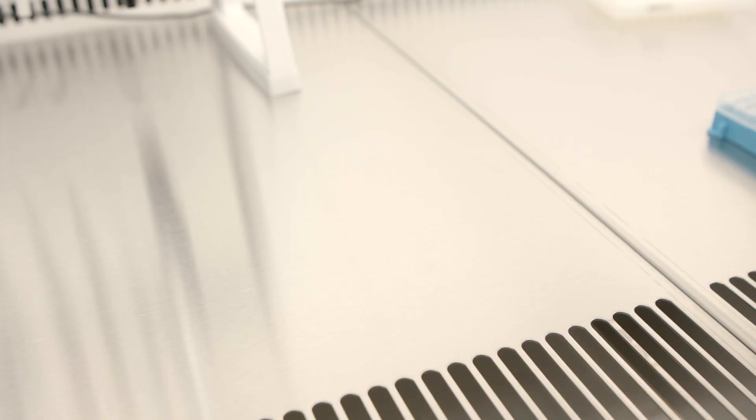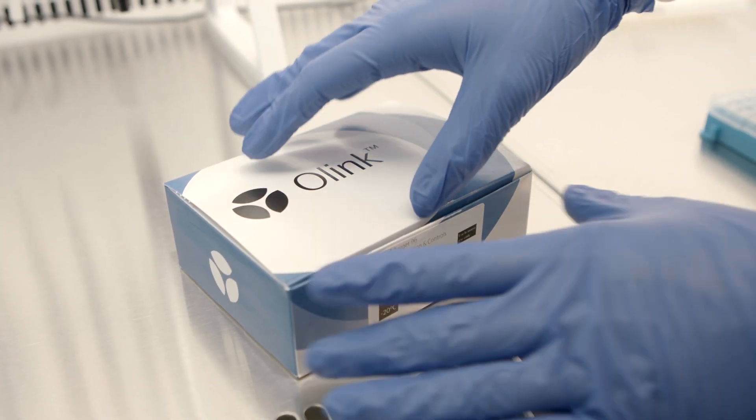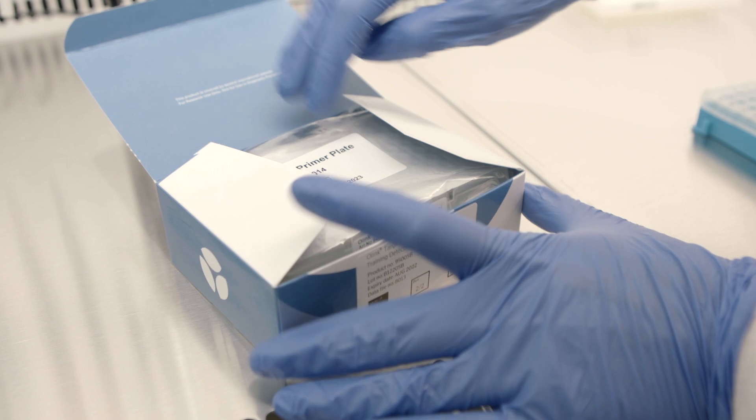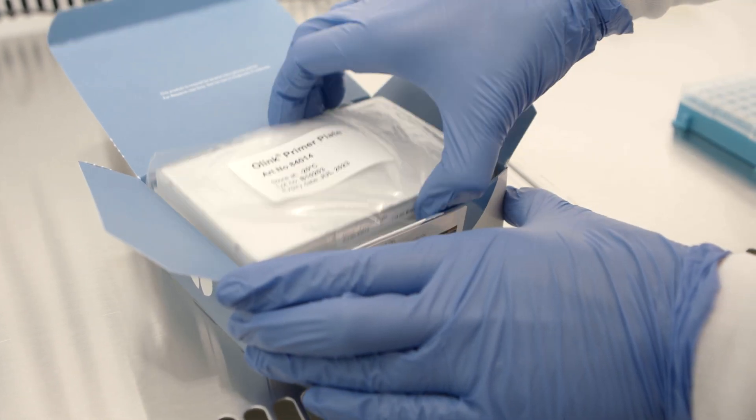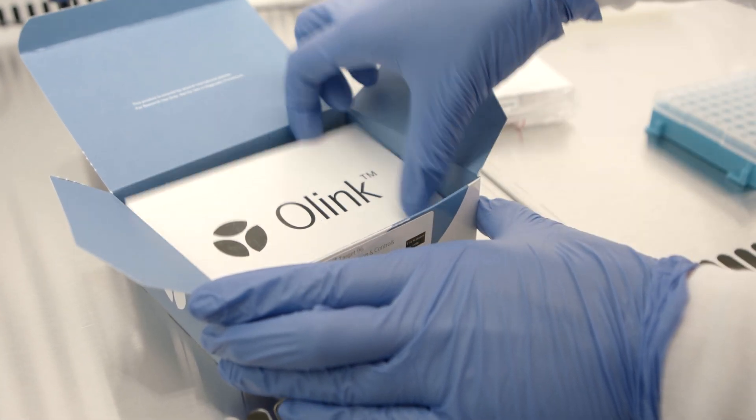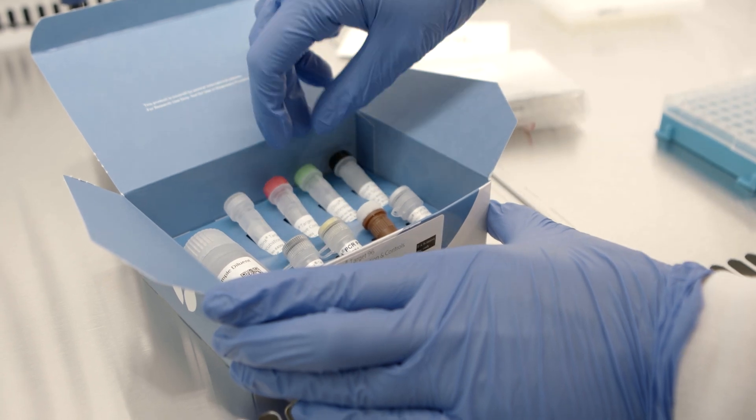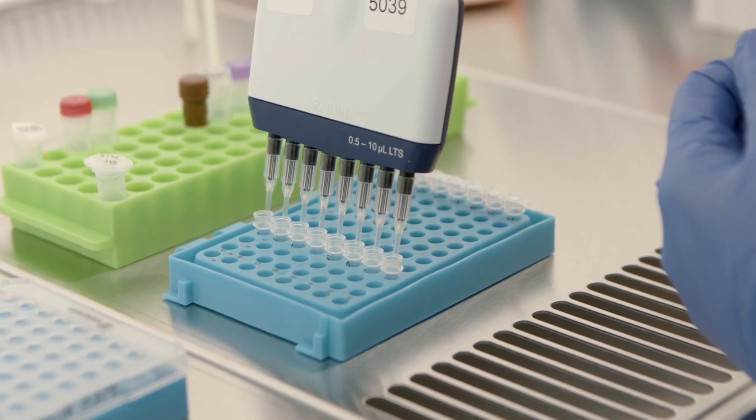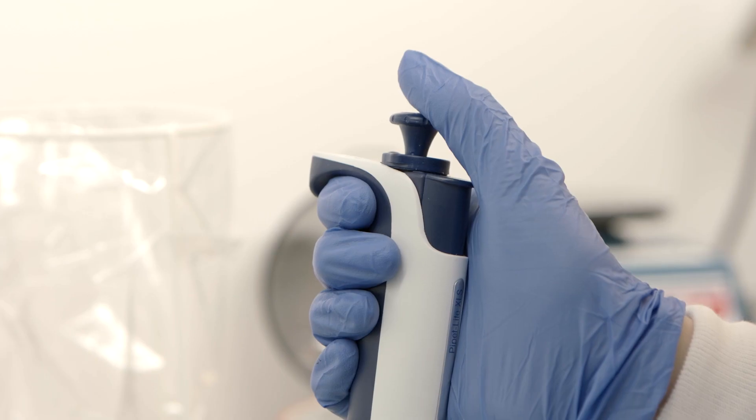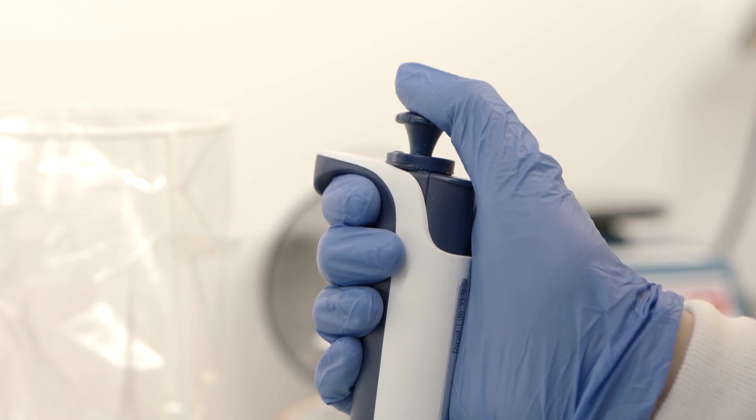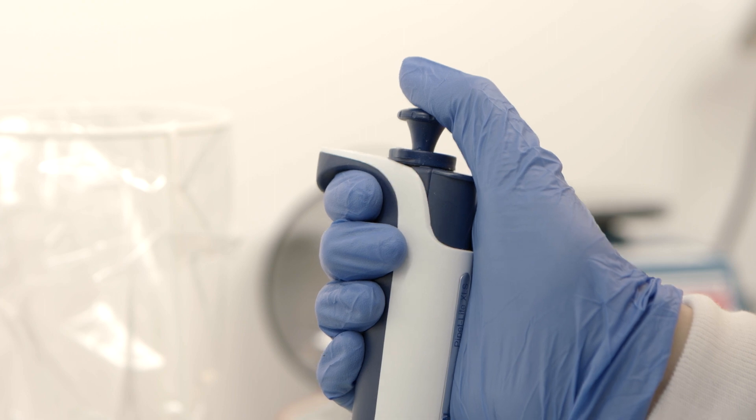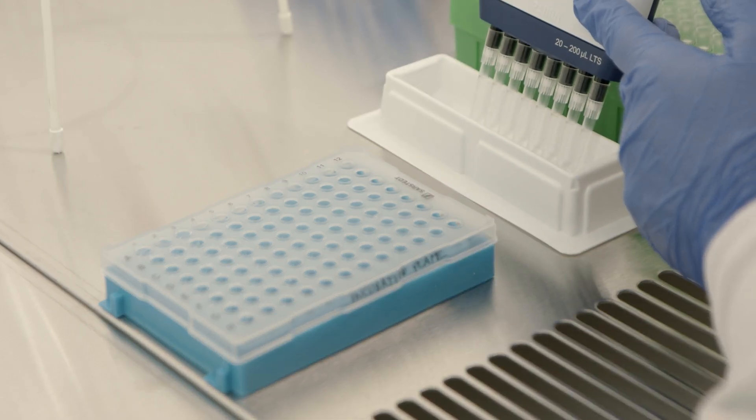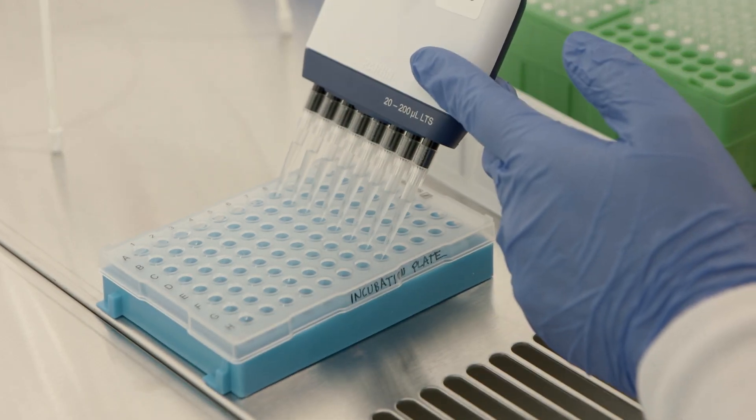Our signature Q100 instrument is specifically designed for qPCR readout of all our target panels. The following instructional video illustrates the workflow for analysis of the target 96plex panel focusing on inflammation using human serum or plasma samples. O-Link panels that target high abundant proteins require an additional sample preparation or dilution step. The inflammation panel run in this video does not require the extra dilution step.